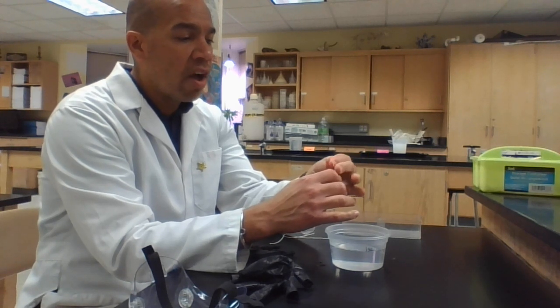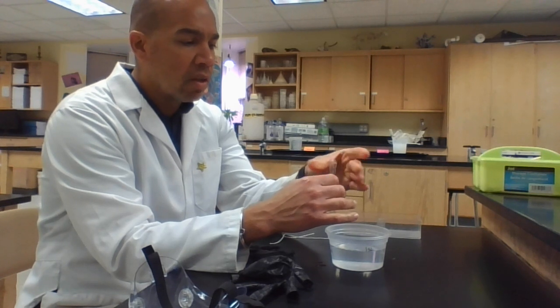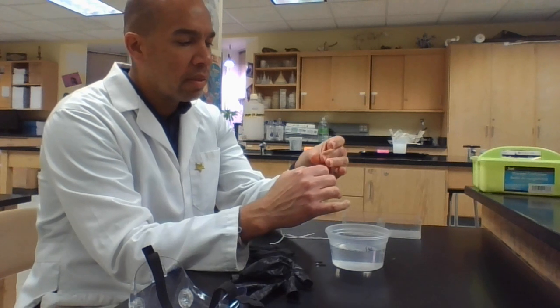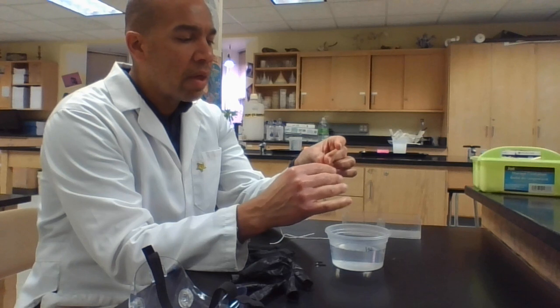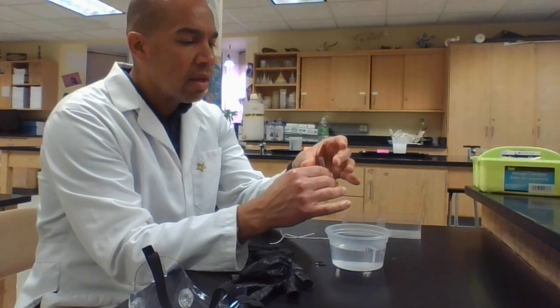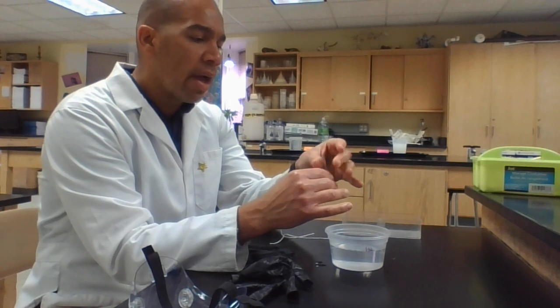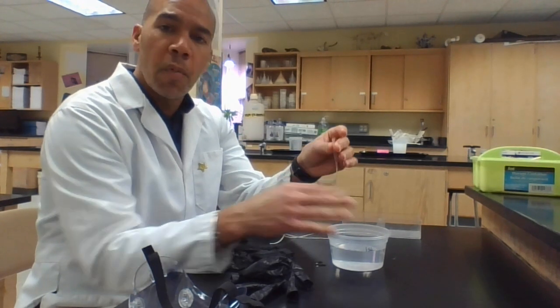Usually as it starts to dry, it starts to get a little bit easier to do because you get a little bit of friction that allows you to open this. Okay, and there we go. We're starting to get it to open. And so now that I have one end open, what I could do next is take a pipette and poke it through the top just to kind of open it up a little bit.